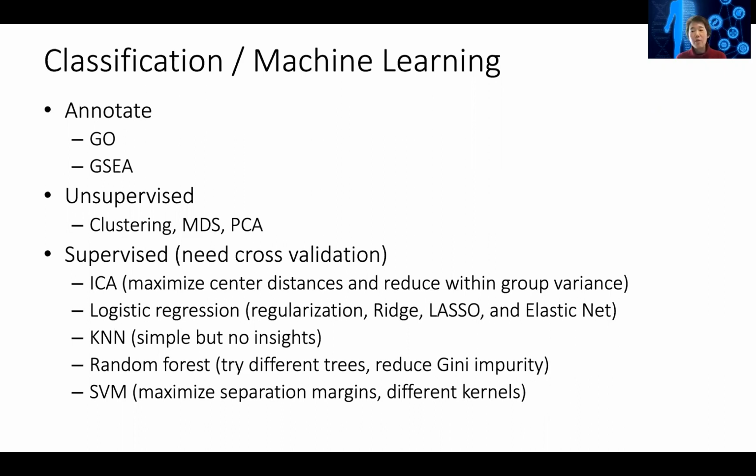In addition, over the years, the group that developed GSEA have looked at many differential gene expression data to generate gene signatures. So if you identified a group of differential genes in some condition, you run the GSEA, and it can use the other signatures to tell you that somebody else has done a similar experiment and saw those genes as differentially expressed, which is similar to yours.